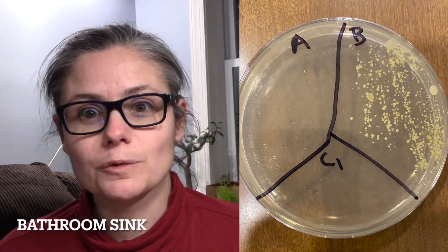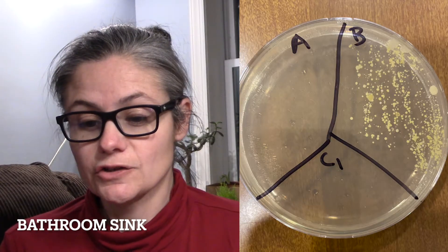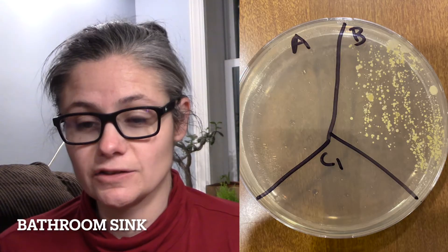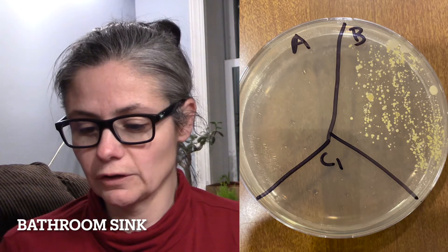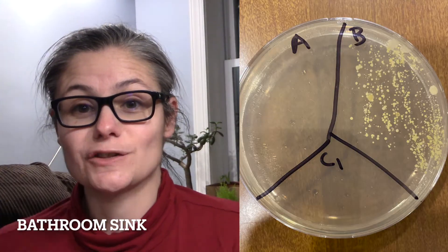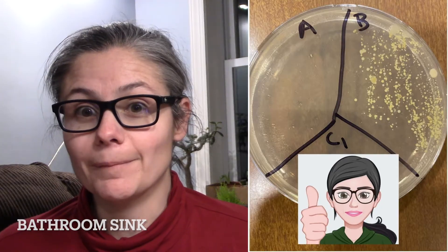Now for some results. Dish number one: bathroom sink. This is looking fantastic. In B for before, we see all sorts of different bacterial colonies — a couple of different sizes and shapes, so different types of bacteria. In A for after, I'm going to give this a really good look — I don't see any at all. Zero colonies. So I'd say Dr. Bronner's is very effective at disinfecting my bathroom sink.